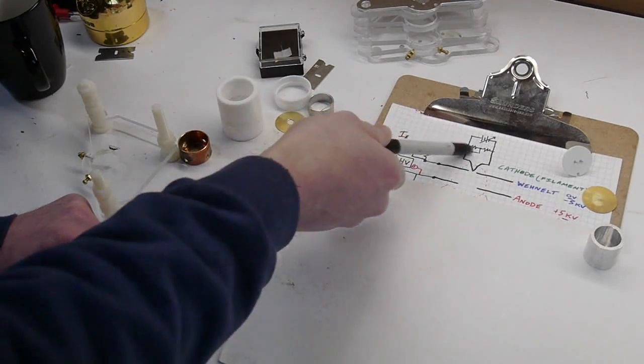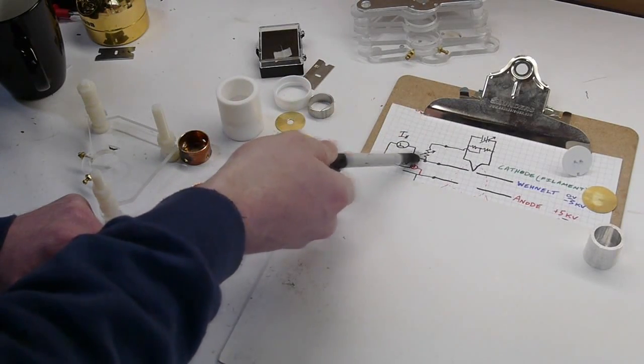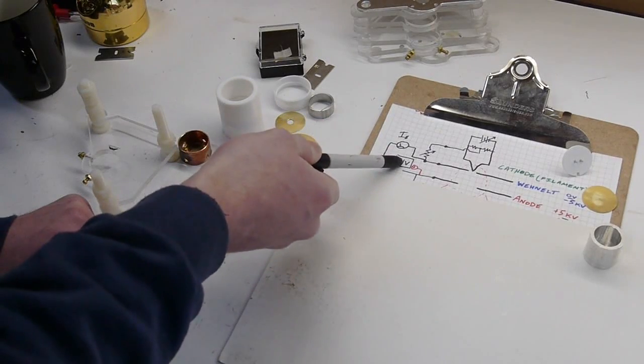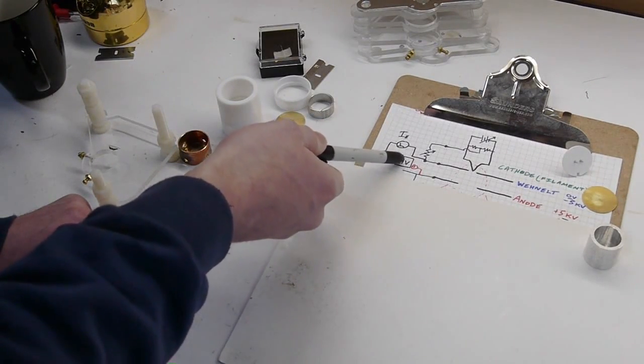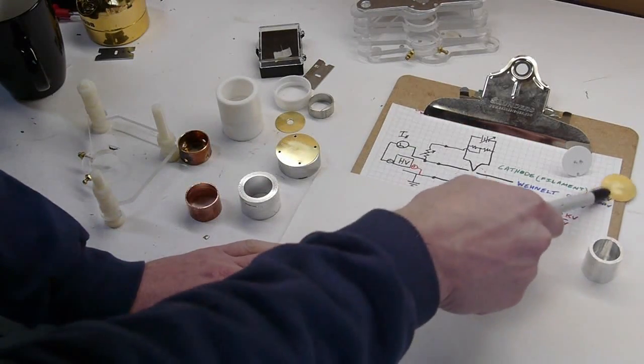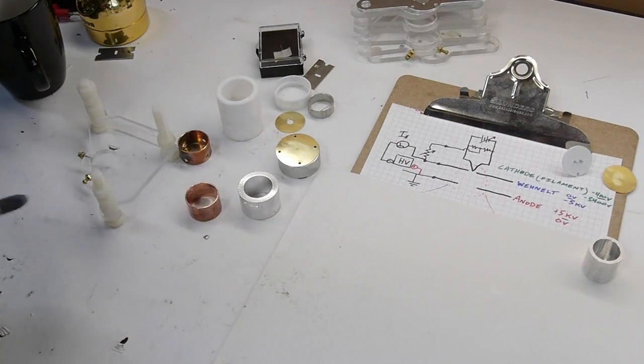The actual high voltage supply connects to the anode. So one convention I wanted to talk about first is how to measure voltages in a system like this.